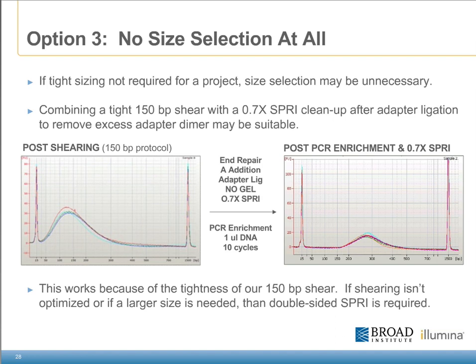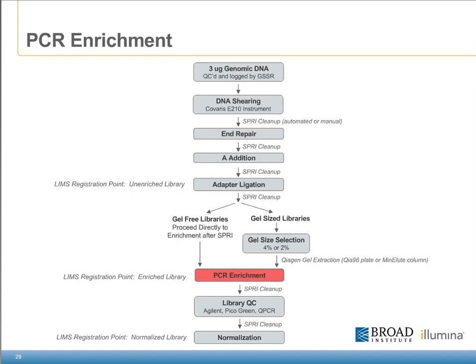As you can see, these are fairly robust because, again, we only took 1/30th of that DNA and put it through enrichment PCR, and we still have a pretty good yield. We could do 29 more of these PCRs and get 29 times the yield here. So plenty of DNA, great for high coverage projects where you have to run lanes and lanes and lanes. So now that you've size selected your sample, the next step is to PCR enrich the sample.